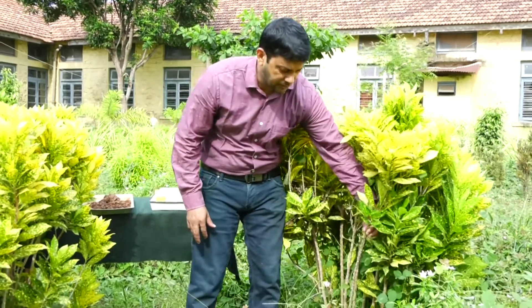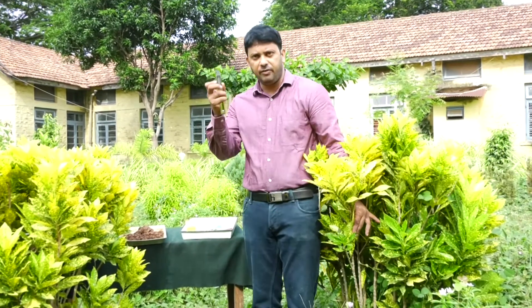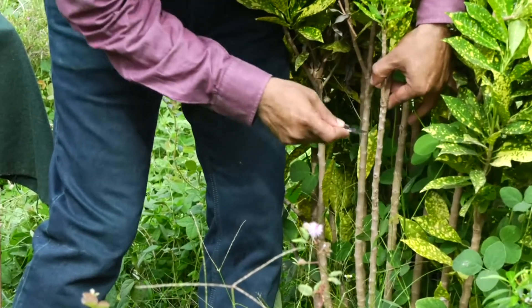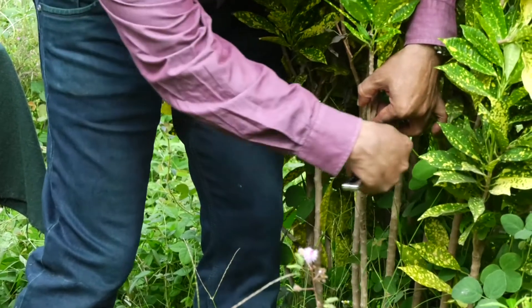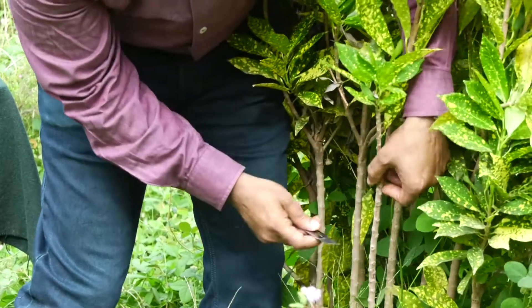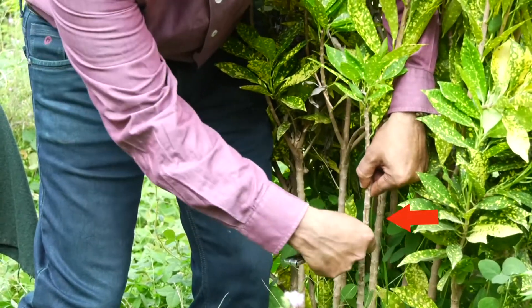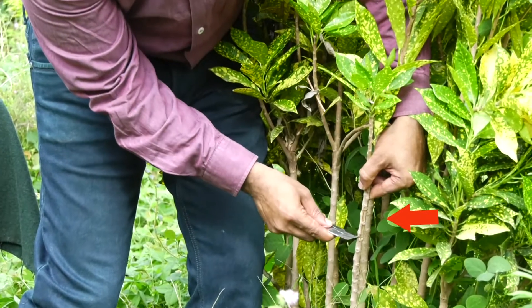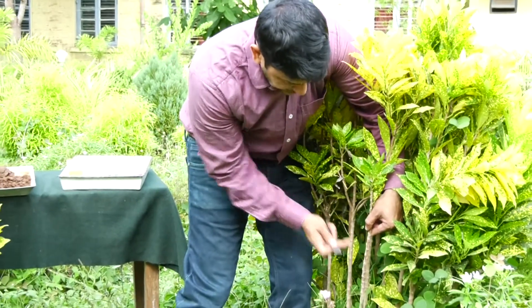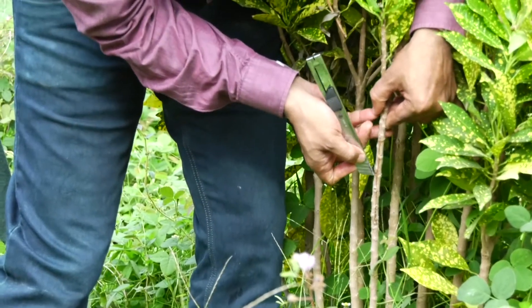Select a healthy branch. I will use this branch for my demonstration. Then take a knife and select this portion for layering. Now take a superficial transverse cut at one particular point like this, then again take a transverse superficial cut here. The distance between the upper cut and the lower is approximately 1.5 to 2 centimeters. After taking these two cuts, take a longitudinal cut between the two transverse cuts.